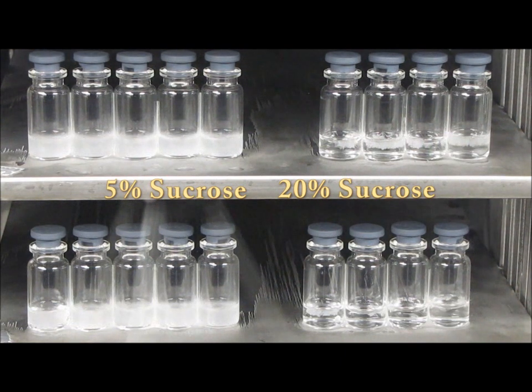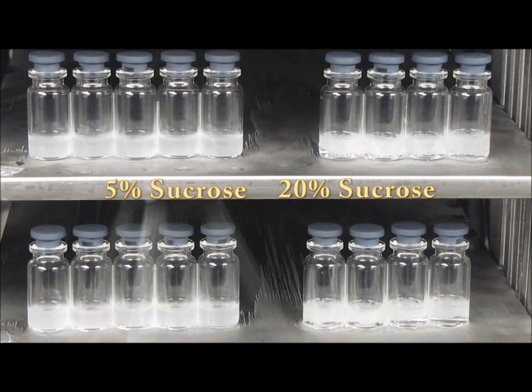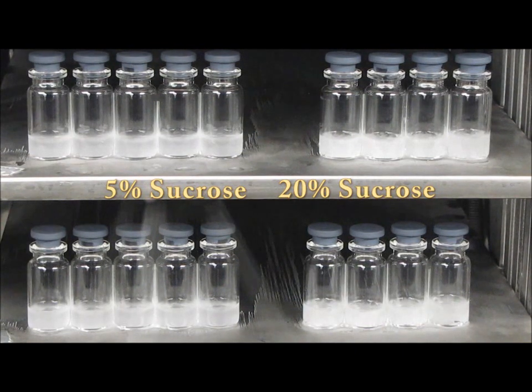A good freezing process can produce consistent product and faster drying cycles. Freeze Booster by Millrock Technology is a patent-applied-for technique to control nucleation during the freezing step of the freeze drying cycle. Unlike other techniques, Freeze Booster does not need high positive pressures which require expensive ASME rated pressure vessels. Freeze Booster has been demonstrated to work on systems as simple as laboratory scale with clear acrylic doors that never produce a positive pressure.